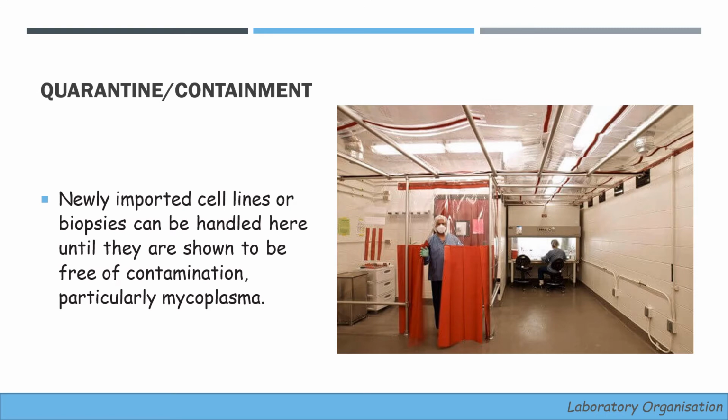Now, quarantine and containment areas. Newly imported cell lines or biopsies can be handled here until they are shown to be free of contamination, particularly mycoplasma.